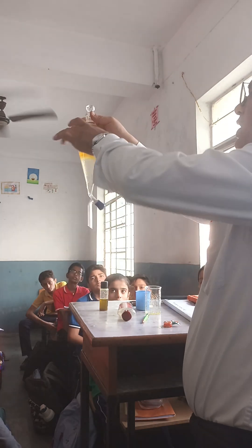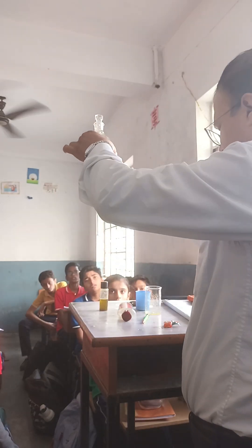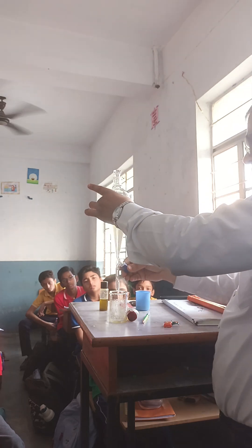Mustard oil is now on the top of the separating funnel. Now we have to separate it — put the top open and water will come out.